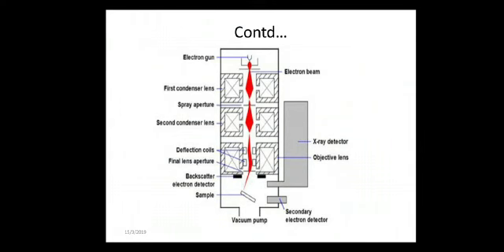Here, only a knowledgeable and experienced researcher is able to identify the actual data which we get through the scanning electron microscope. Only a proper operator can detect or identify the actual data. Without proper knowledge, it is very difficult to analyze the data obtained through a scanning electron microscope. That is the main drawback in the case of the scanning electron microscope.